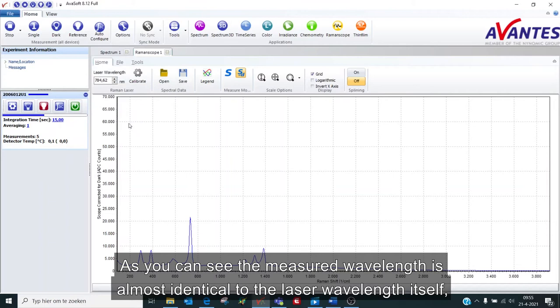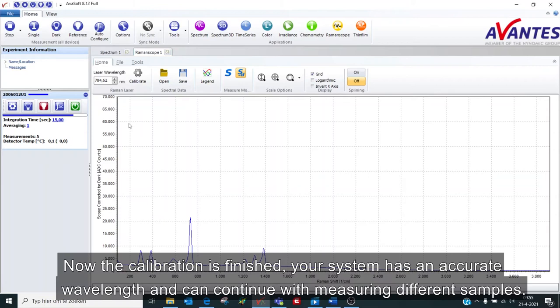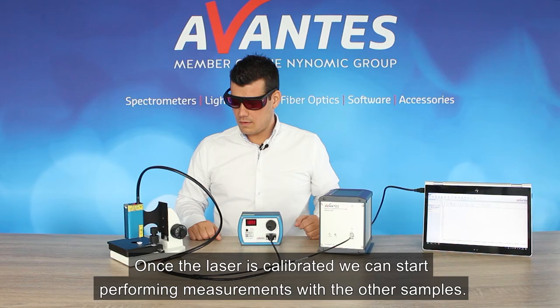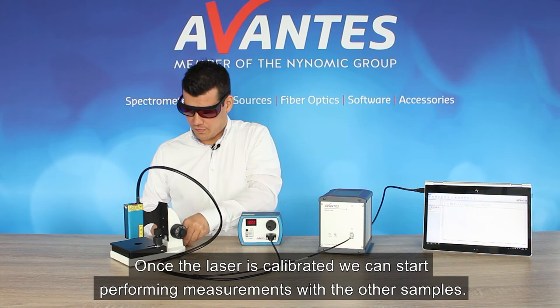Now the calibration is finished, your system has an accurate wavelength, and we can continue with measuring different samples. Once the laser is calibrated, we can start to perform the other samples, medicines like aspirin for example.